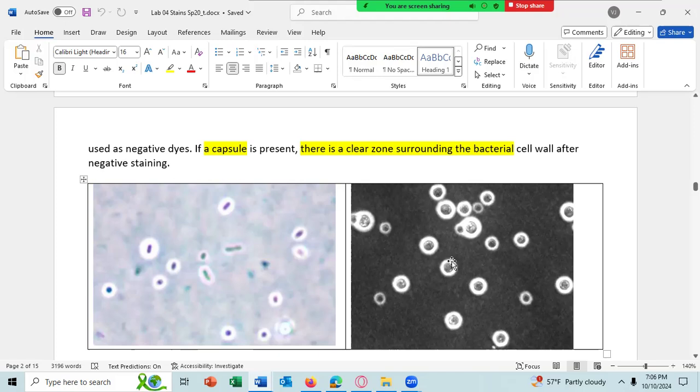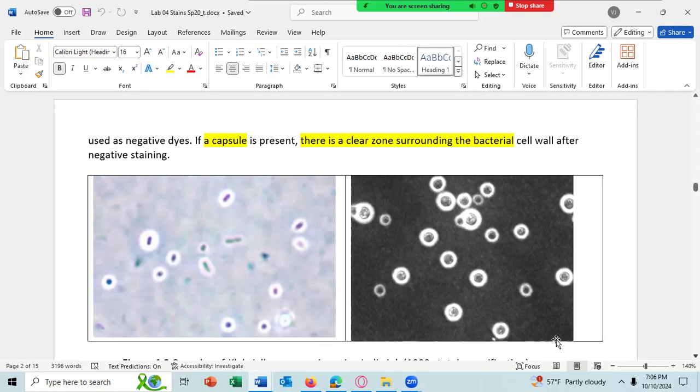In the gram stain, if you were to apply the gram stain to the cells, the process of the gram stain, especially the water rinsing, will wash away the cell capsule. And so you will not see it in the gram stain. Any question about any of that? As with the gram stain, the cell capsule would stain the same as the slide, but actually with the gram stain, it's too rough and the capsule will wash away.